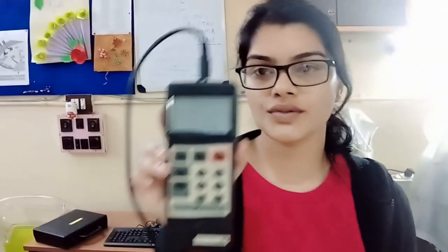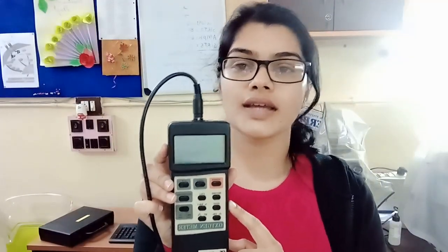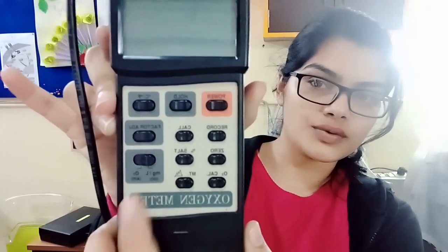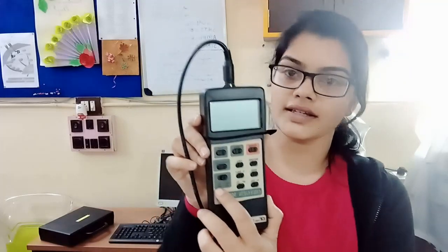Before, we discussed the titration method of measuring dissolved oxygen. Today we will be introduced to the portable oximeter device by which we can measure the DO easily. So this is the portable oxygen meter. This is the power button, and this is a dual oxygen meter by which we can measure both the oxygen in air and the dissolved oxygen by switching this button to mg per liter and O2 in the air. Mg per liter is for measuring the DO and O2 in the air is for measuring the oxygen in air. Now this is the probe which we dip in the water.